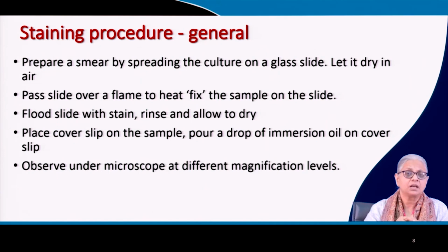Then you add a stain. Your stain can be a simple ink. It can be methylene blue. We used to use methylene blue. You can use crystal violet. You can use any stain. Okay, and you flood the slide with any stain and then rinse it with water.